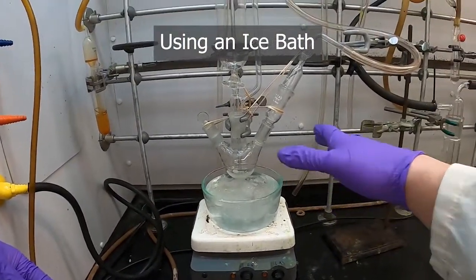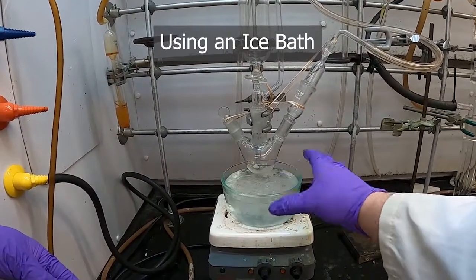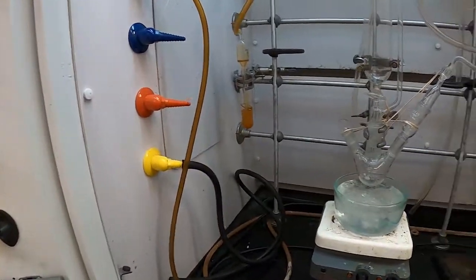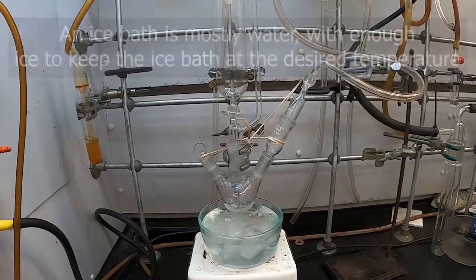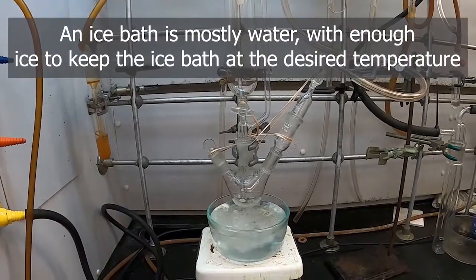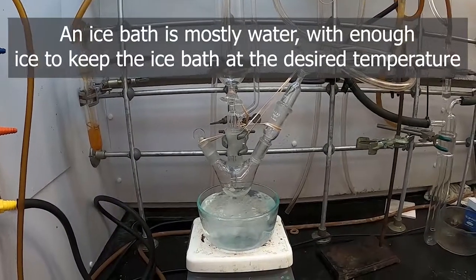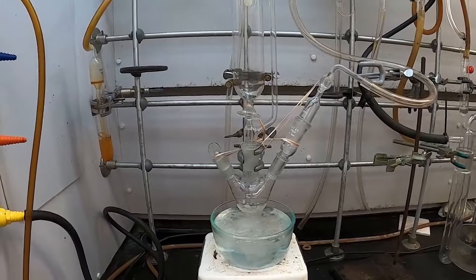Also, have a bath that's appropriately sized to your flask. This one might be a tad oversized for this small of a flask, but it should still work well. Making an ice bath, you often use more water than actual ice. I liken it to making cereal, and it can be done in any order.